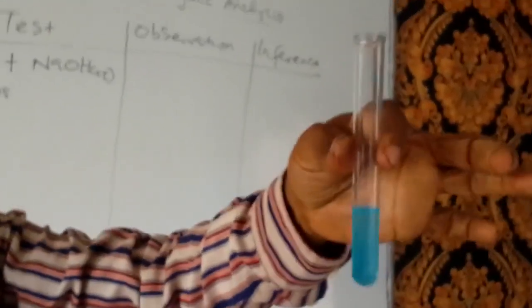Okay. Having done that, to test for the salt, I'll collect a little amount of it inside a clean test tube.